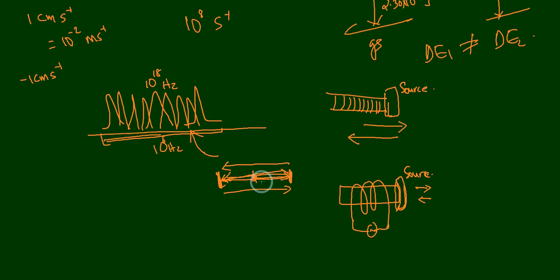So if you are using a loudspeaker coil, we can get a range of velocities for the source nucleus. And if we are connecting this to a multi-channel computer, that multi-channel computer will record all the source velocities at every point, and also it will record the count, the reading from the Geiger counter, for example.